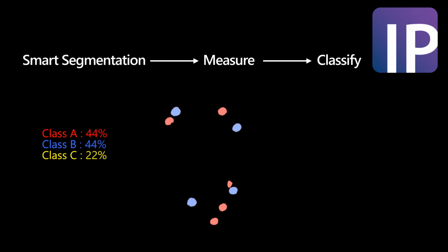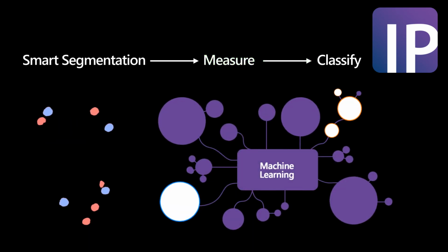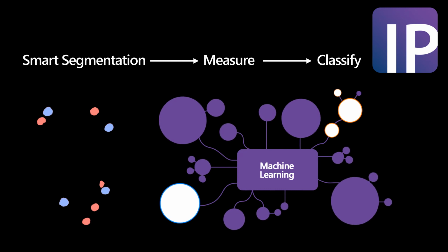After determining the population of objects, a third refinement stage is available to classify the objects. Classifying the objects into categories allows the user to statistically report on groups of structures rather than individual objects, and by doing so, develop more meaningful results. Image Pro will auto-classify objects based on a measurement or several measurements from the previous stage. Learning classification, a machine learning-based method, can isolate populations of objects based on small morphometric or intensity differences to correctly assign and classify the objects.